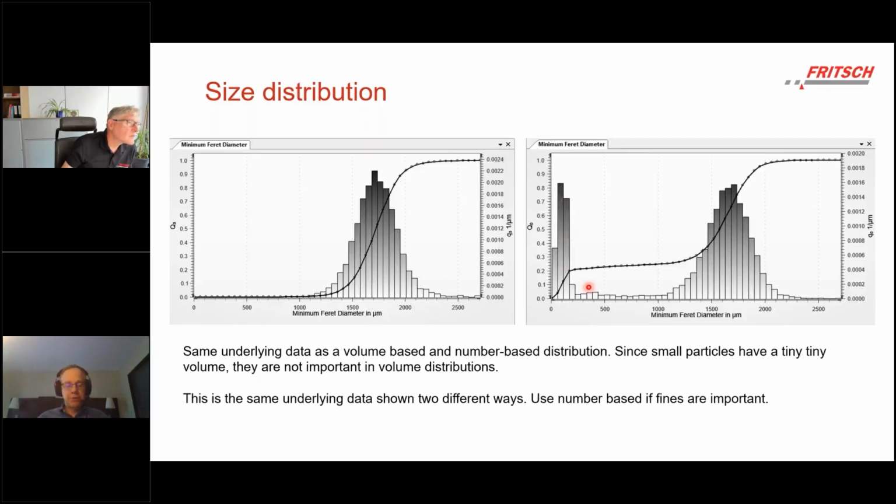And this is something we've talked about in other forums, but if you look at the quantity of particles by mass, that's really a volume-based distribution on the left, and that's what naturally falls out of, say, laser diffraction data or a sieving analysis. And it's a little bit numerically hazardous to convert over to a number-based distribution.